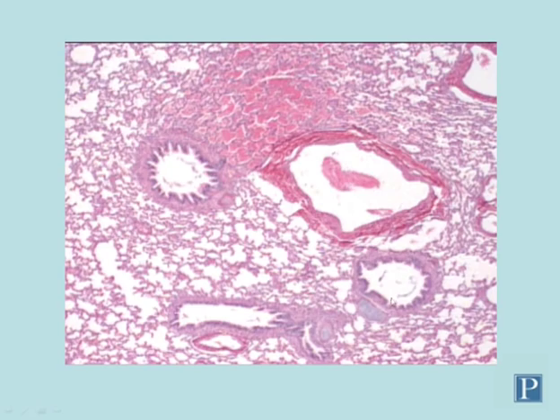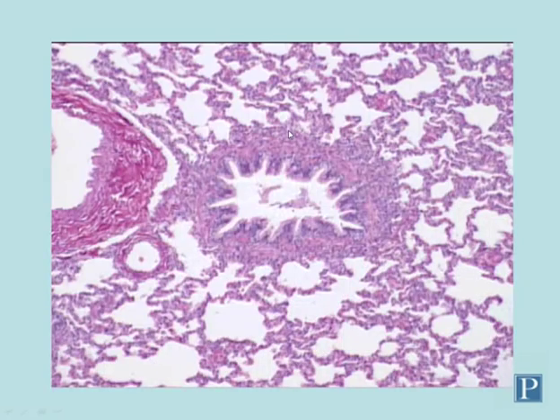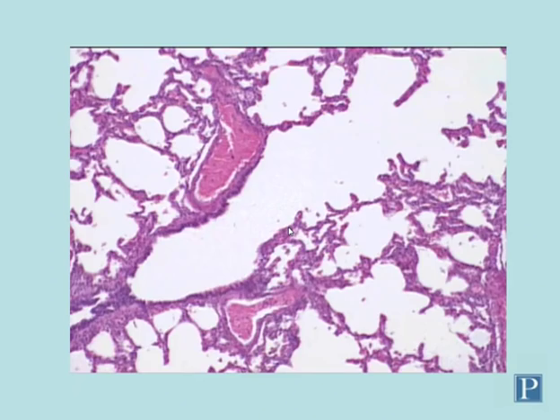Here's another bronchus, and another one down here. This is a blood vessel which appears to have ruptured, leaking blood into the pulmonary spaces. Here's another example of a bronchiole — notice the absence of hyaline cartilage.